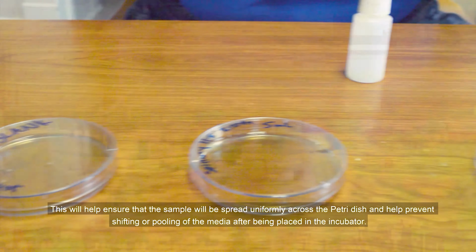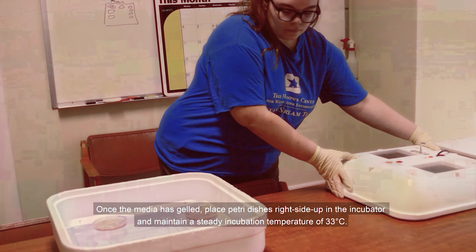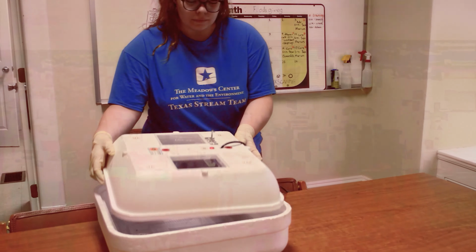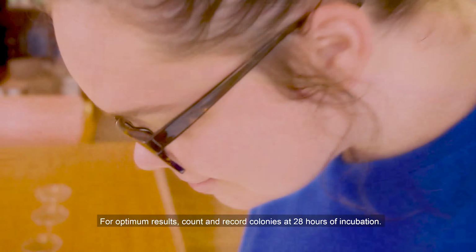Once the media has gelled, place petri dishes right side up in the incubator and maintain a steady incubation temperature of 33 degrees Celsius. Plus or minus 3 degrees from 33 degrees Celsius is allowed. At this temperature, colonies should not be counted for a minimum of 28 hours. For optimum results, count and record colonies at 28 hours of incubation. No count should be made after 31 hours.